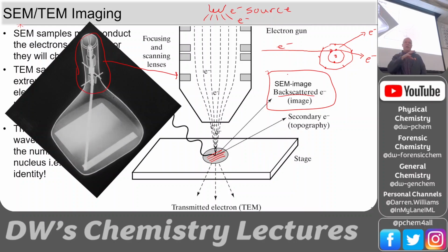So when you take a quick image in the scanning electron microscope of a sample that doesn't conduct electricity, the very first image is going to be your best image. And as soon as the sample starts to charge up, it looks like the bottom of a swimming pool after people have been playing in it for a while. Okay. So this is a problem.